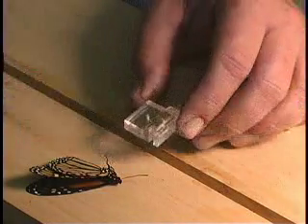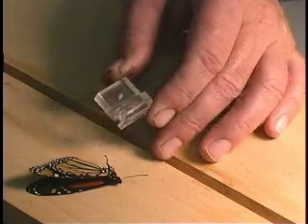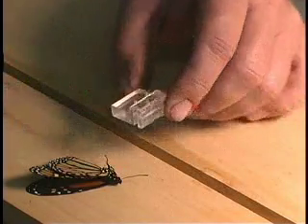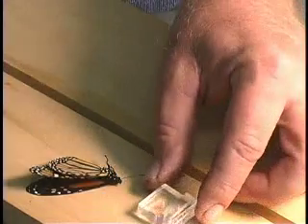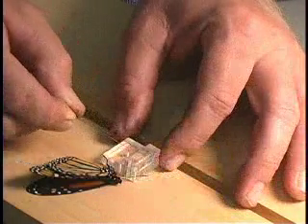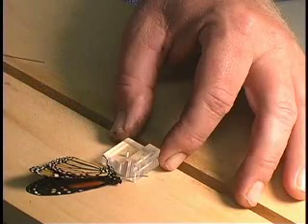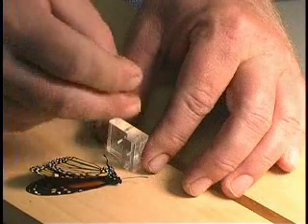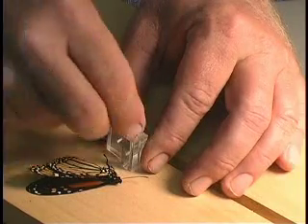The other item that you will need in order to properly position the insect on the pin at the proper height on the pin is a pinning block, and this one is made out of acrylic. There are also wood blocks. This one is designed with 2 holes, one at a higher position, one at a lower position. These holes are used to position the labels on the pin, and then there's a hole on the side of this block that is used to position the insect at the proper height on the pin.